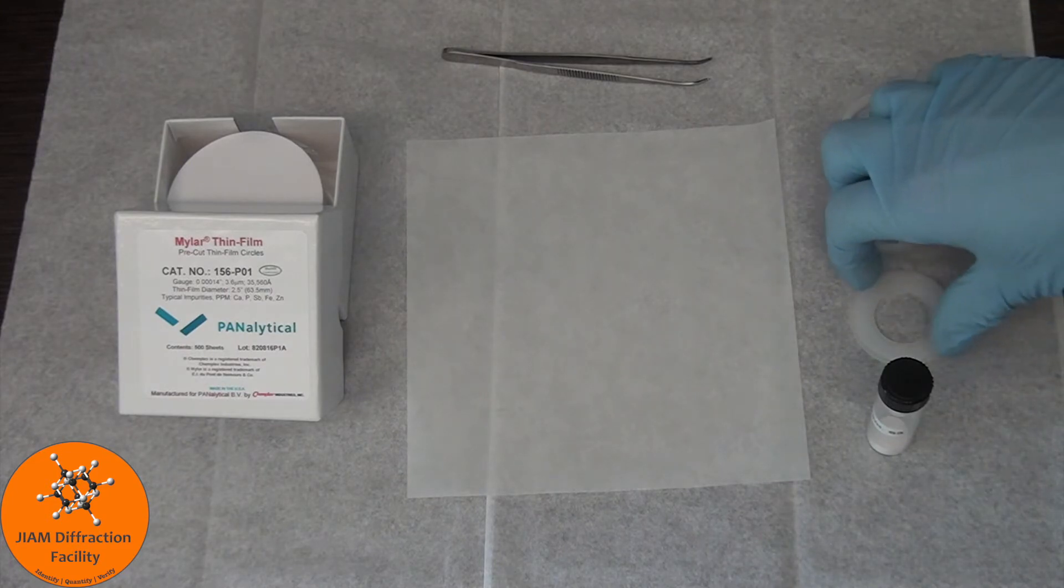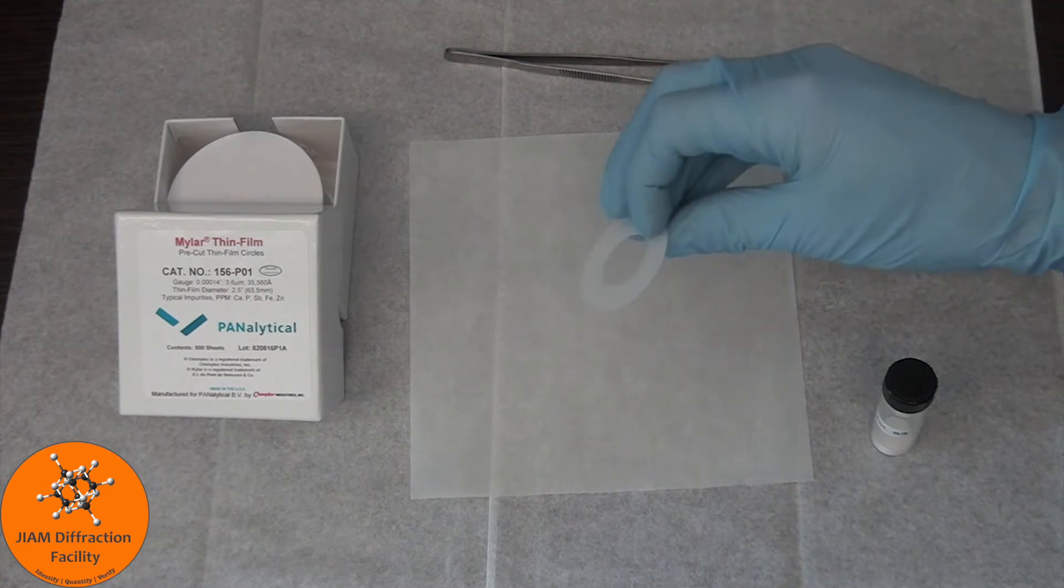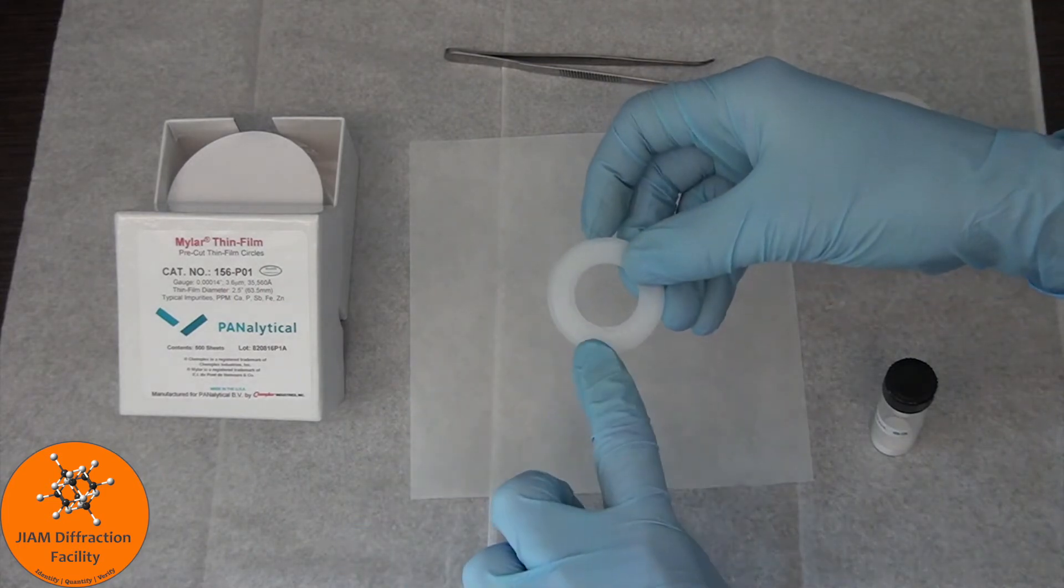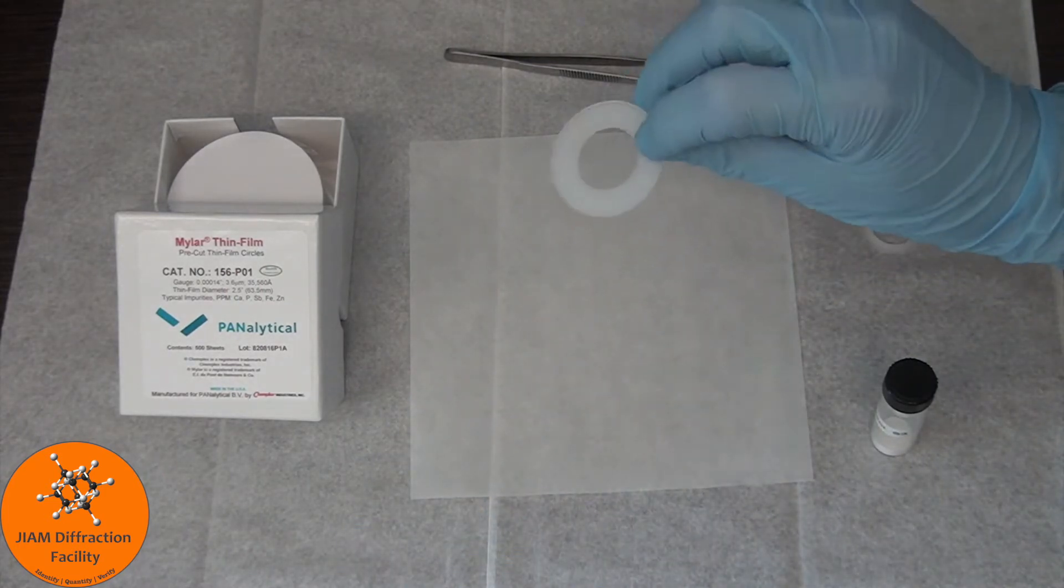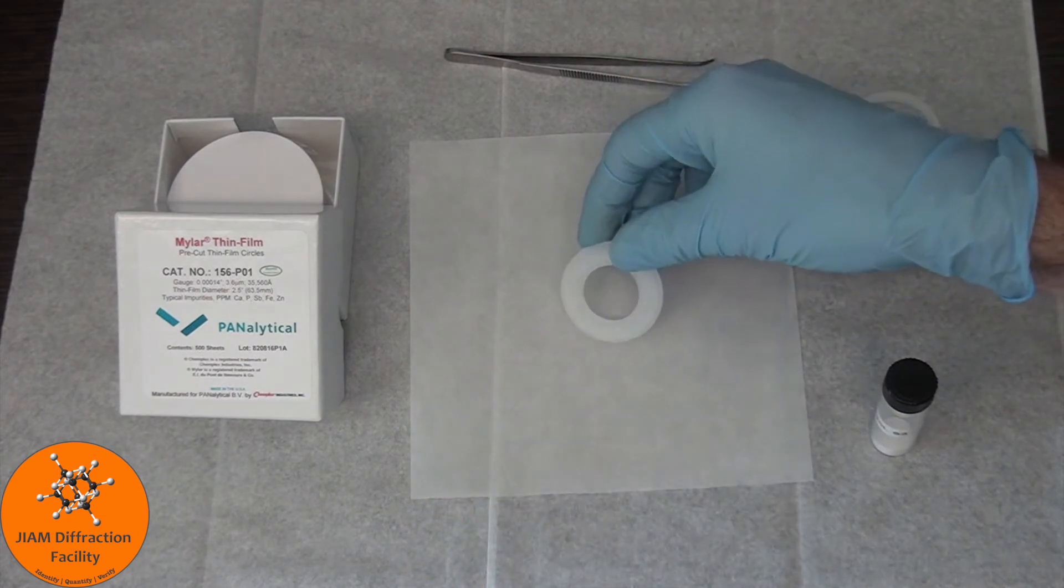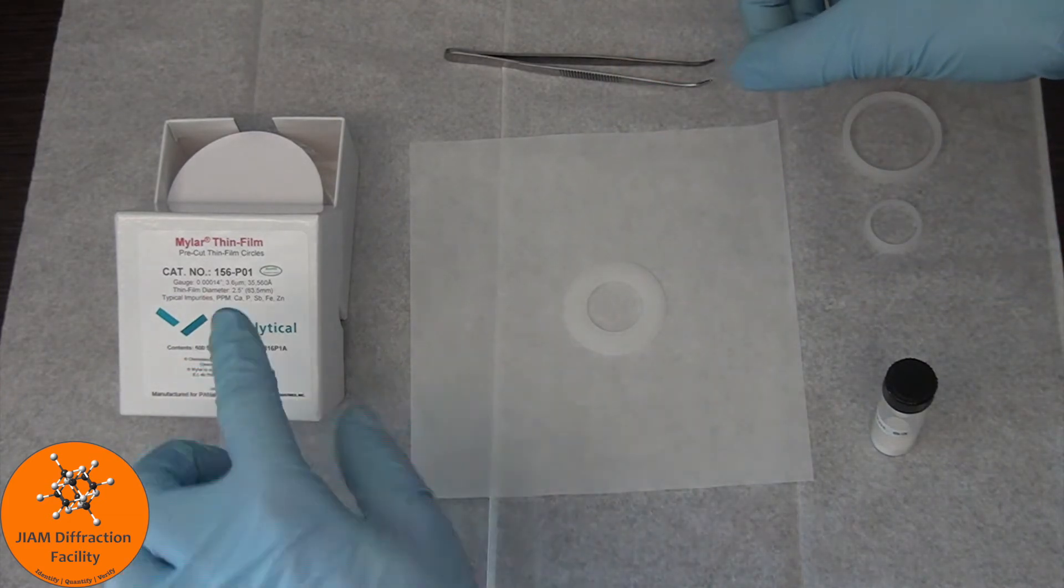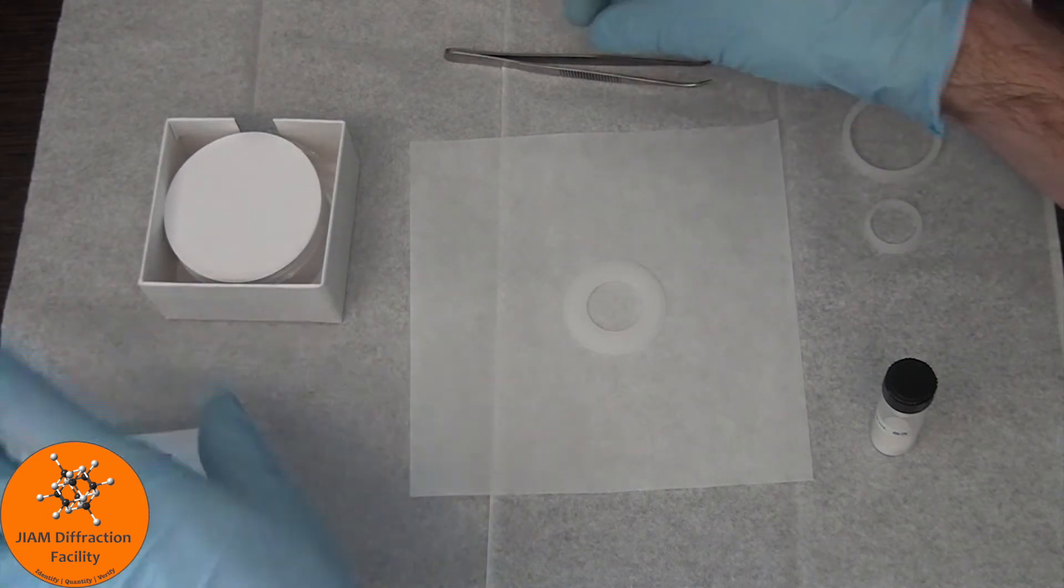We want to begin with this piece, which has a smooth side and a raised side. We want to have the smooth side face down, and then we want to take a piece of this Mylar thin film and place it on top.